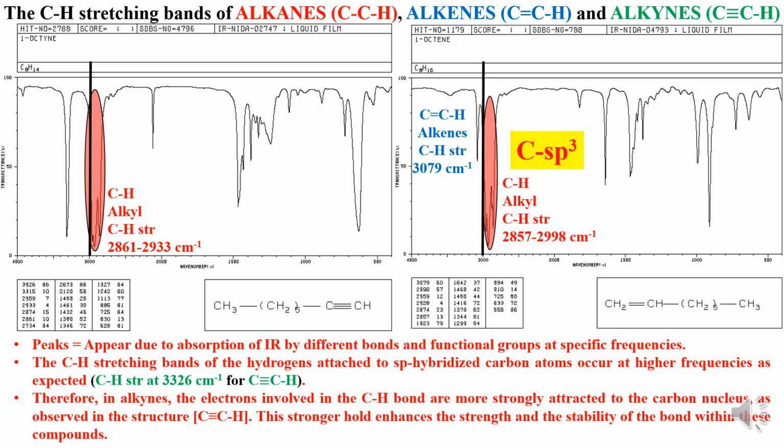And CH stretching bands of hydrogens attached to sp2 hybridized carbon atoms occur at a little bit higher frequency, as expected, because the carbon atom is sp2 hybridized.